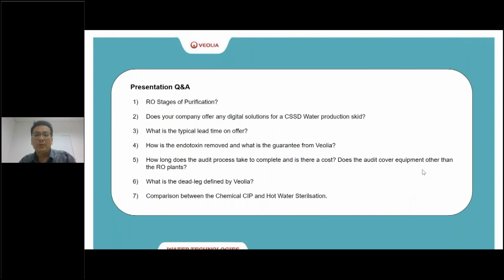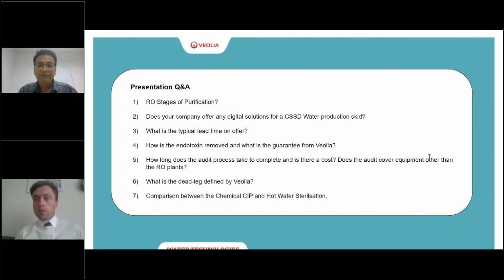The site acceptance test is to make sure that what we conducted in the factory acceptance test matches what we test on site, to deliver the same performance and the same guarantee to our customers. I hope I answered the question well, Anthony. Thank you. Thanks, Theo. That was very good.